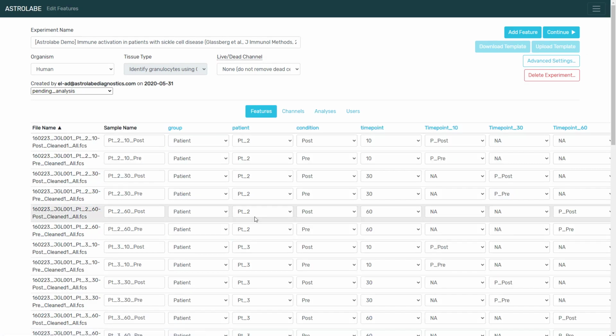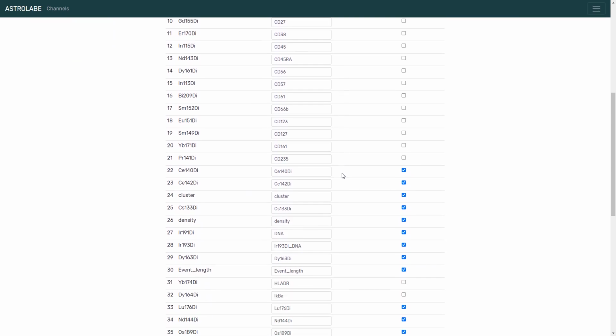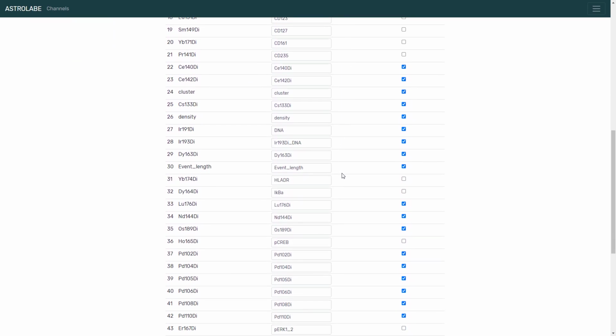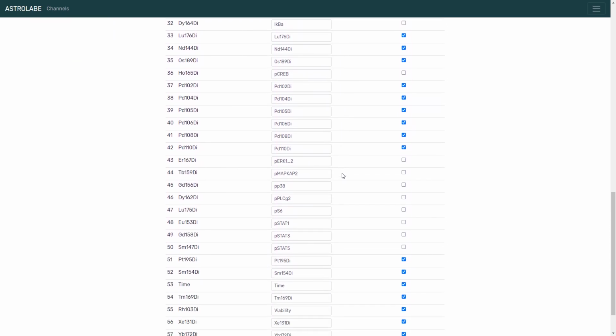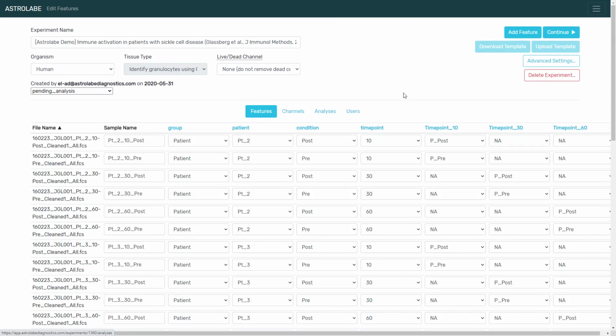Now the analysis is done, it's ready. We're almost ready to begin. One last thing I will mention, always check your channels tab. In the case of this experiment, there might be a few changes we would like to make. So I'm going to take a quick look, and it seems to be fine. However, please review the experiment setup tutorial to see if you should change anything in your channels tab. So that's it, we're ready to start the experiment. I'm going to click on continue and I'm going to confirm. And as soon as I do this, Astrolabe's analysis is going to begin.